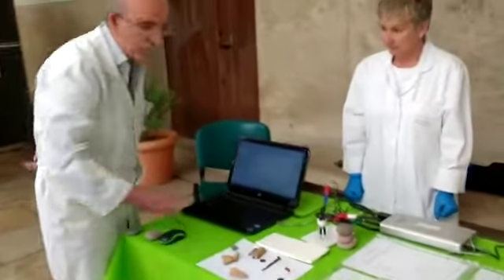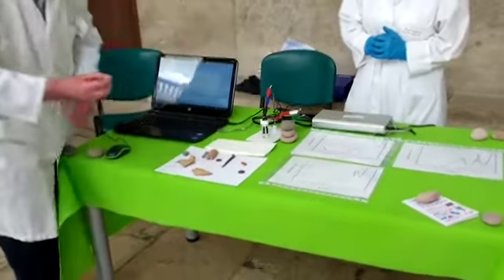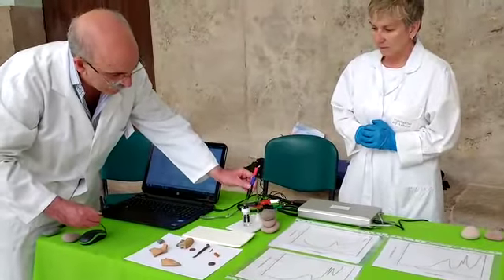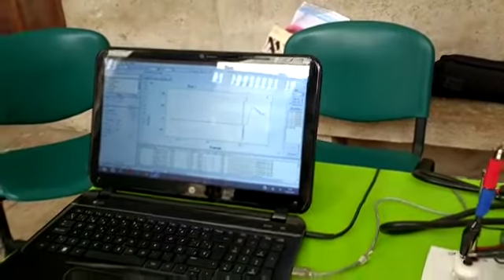This is a methodology for extracting a minimal amount of sample. We take a few nanograms of sample, transferring by abrasion to a graphite electrode. We put the electrode in the electrochemical cell and perform a conventional voltammetric experiment. That is the record of the current that flows through the electrochemical cell upon application of different electrode potentials.